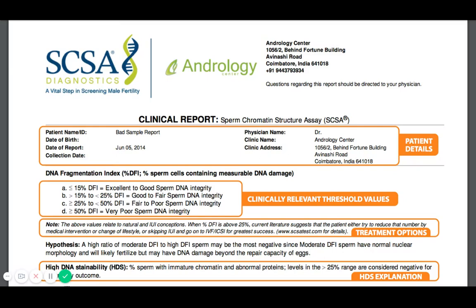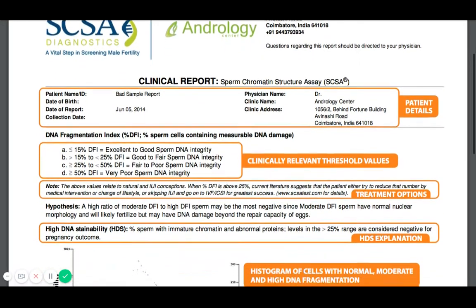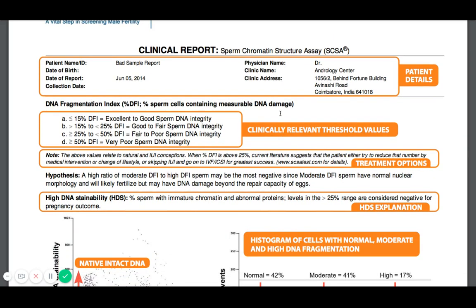I'm going to explain the SCSA test report format to you today. This genuine SCSA test report format is standardized worldwide. At the top of the report, you have the patient details, which is followed by the guideline threshold values that are based on numerous published clinical studies.